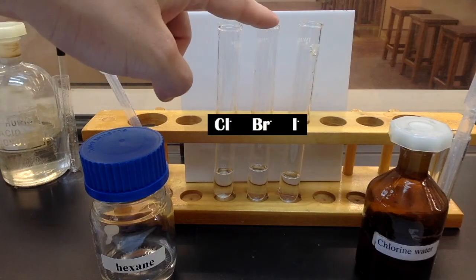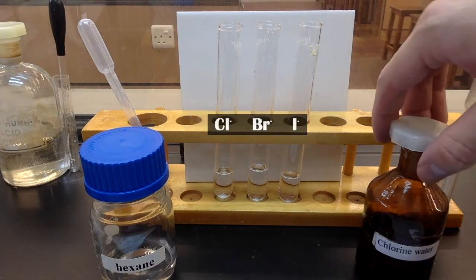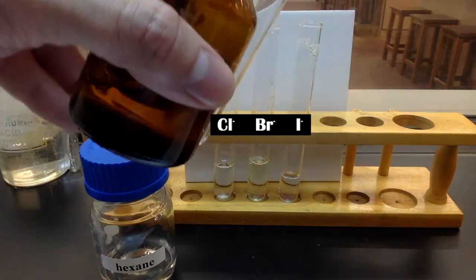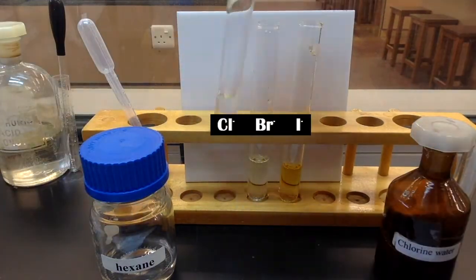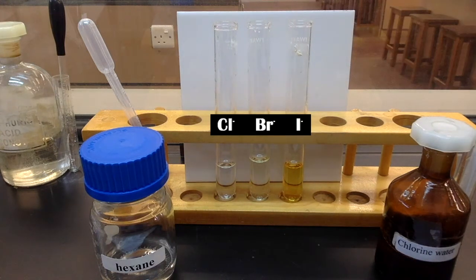Aqueous samples of chloride, bromide, and iodide are prepared. A few drops of chlorine water were added into the samples. The solutions containing bromide and iodide change from colorless to pale brown.